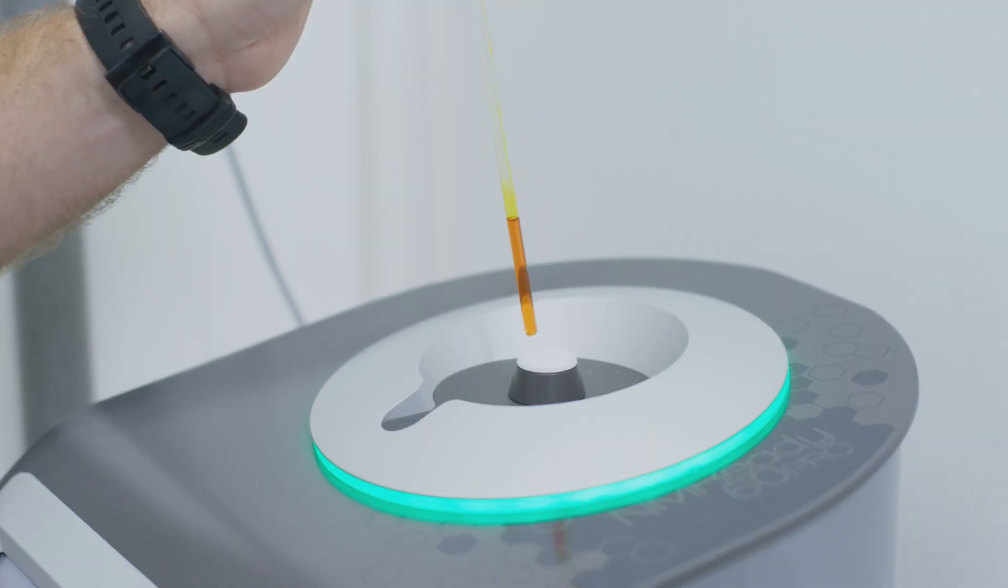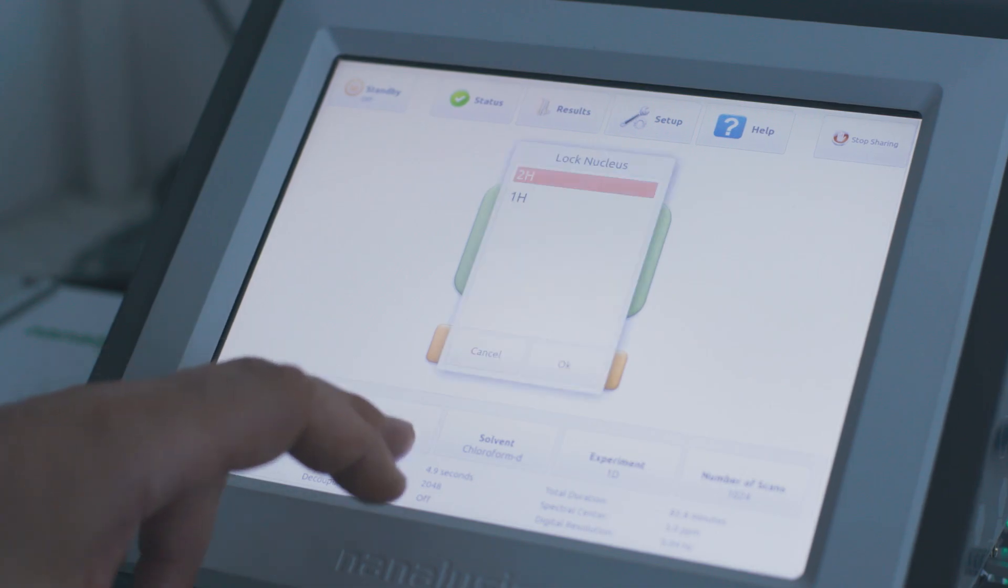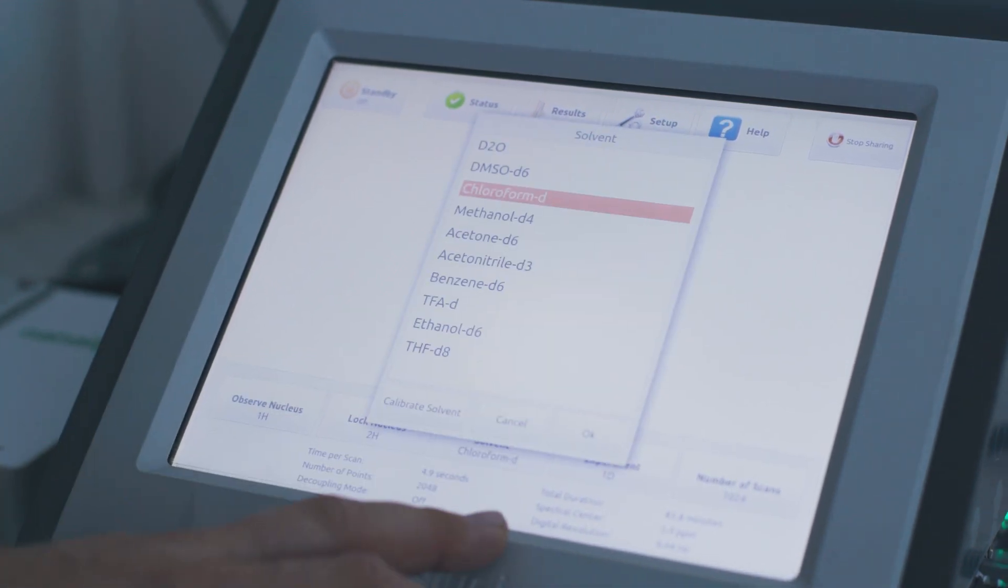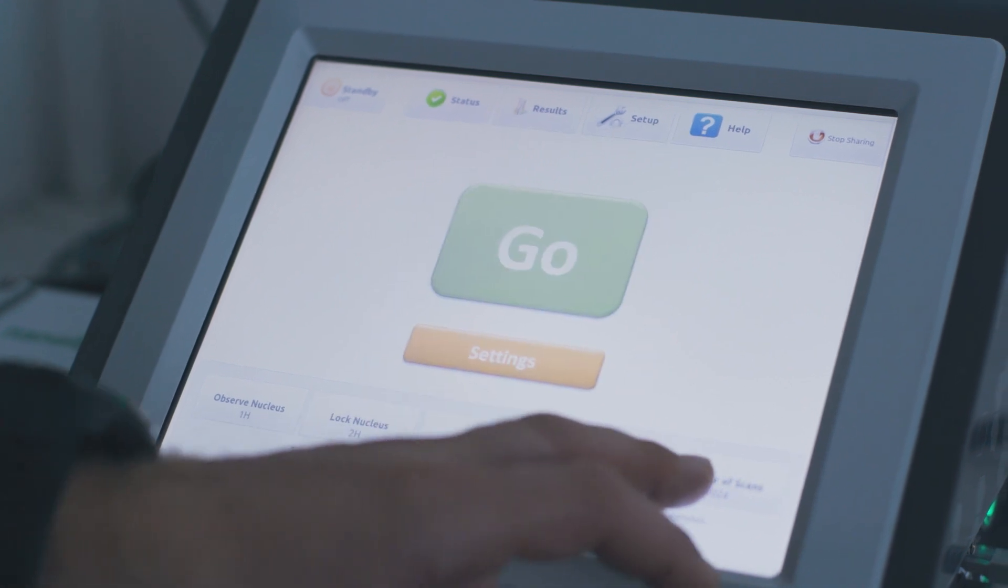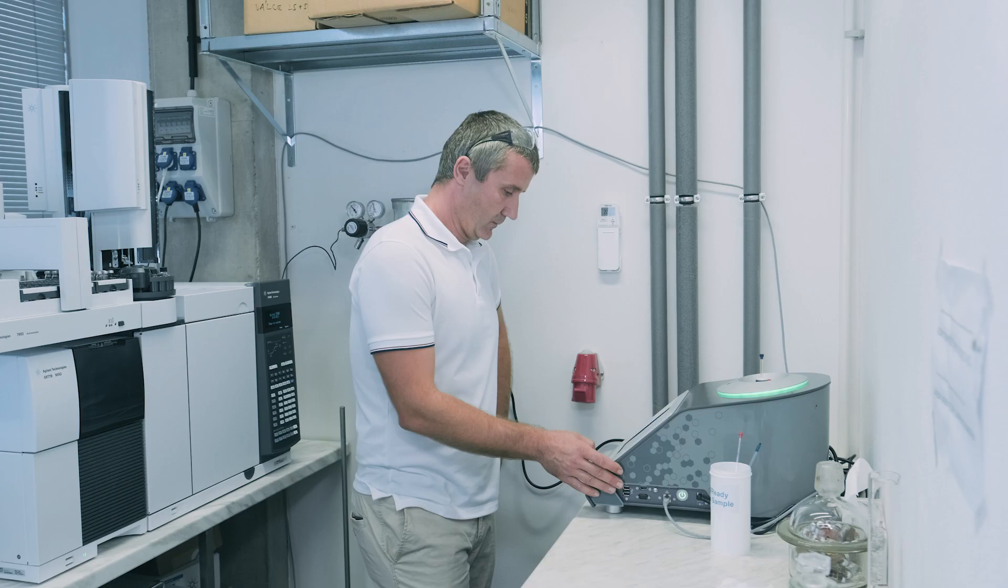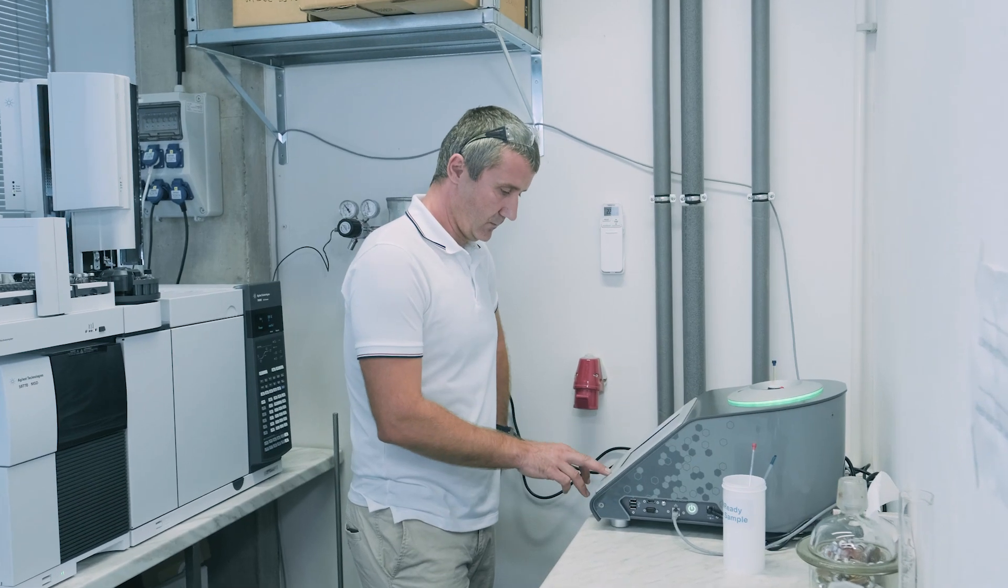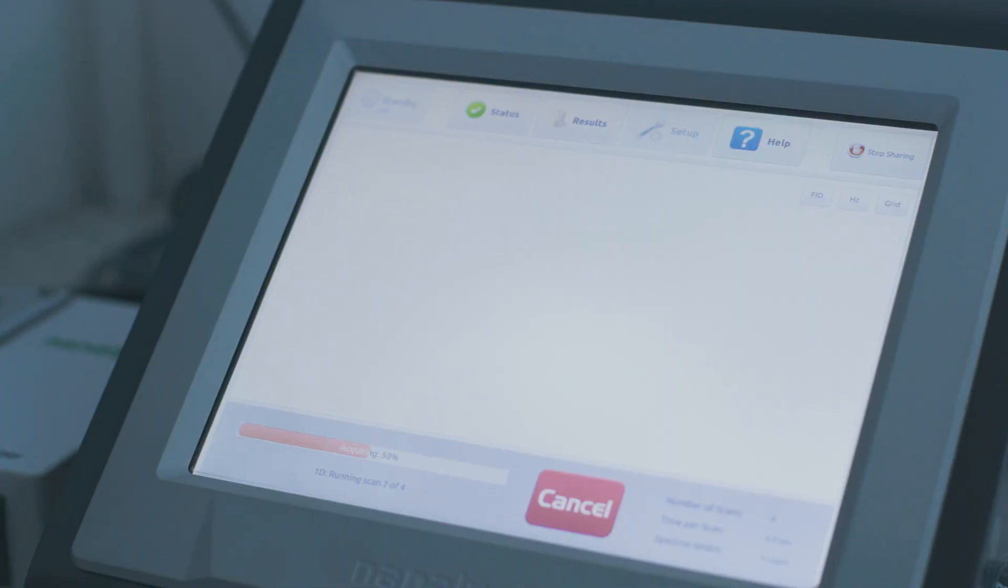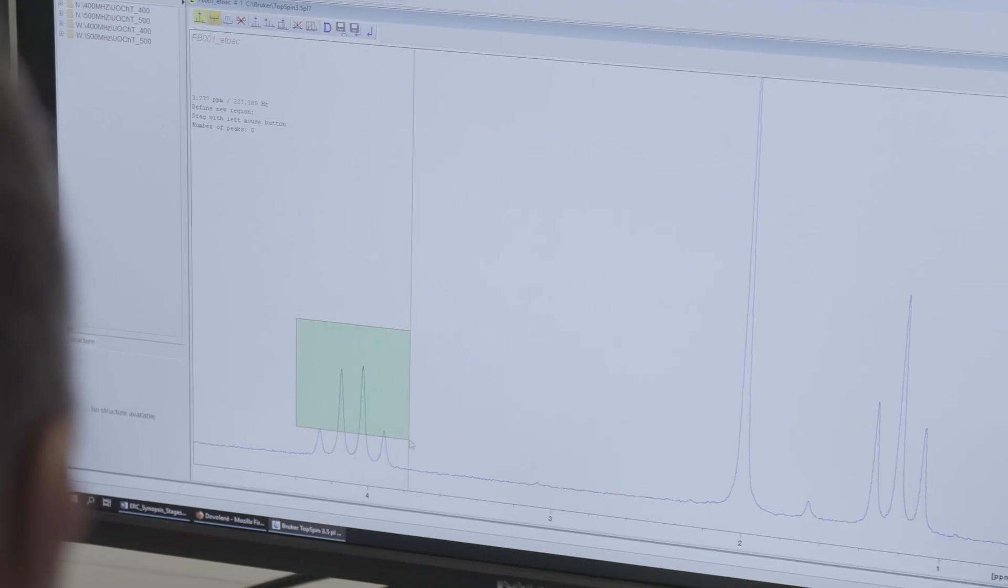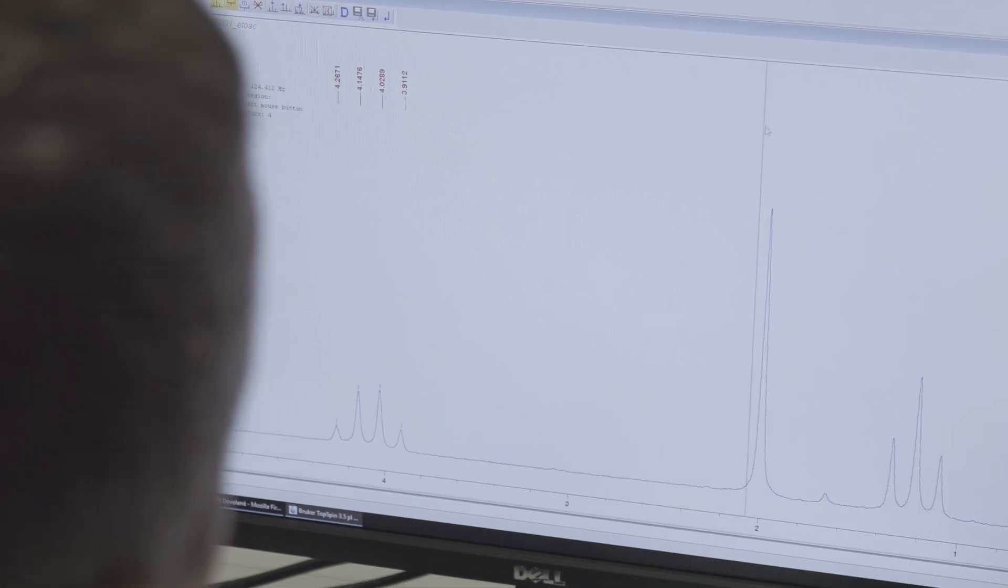Another important aspect is the touchscreen, which is embedded within the machine and doesn't require an additional computer, which saves space on the bench. We can also share the data quite easily. We can connect the NMR ready to the network and all the students and employees can access data easily.